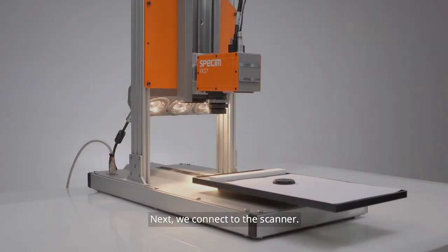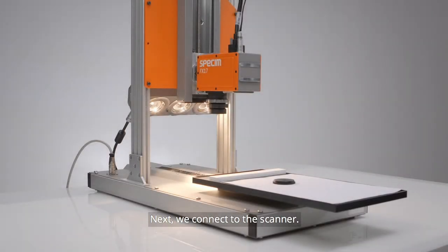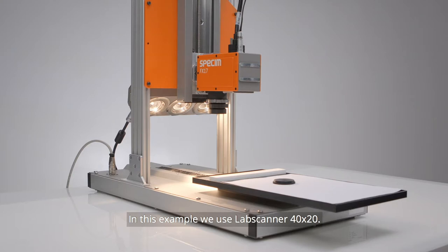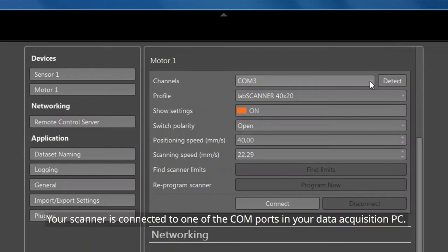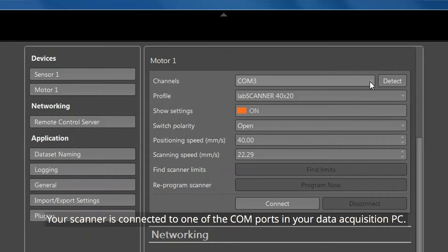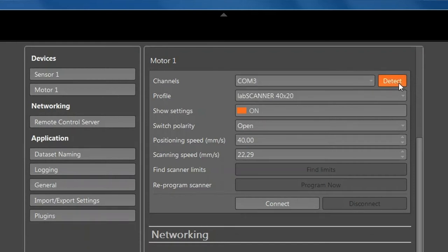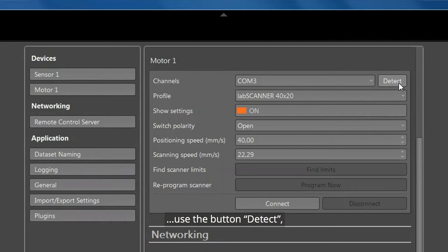Next, we connect to the scanner. In this example, we use Lab Scanner 40x20. Your scanner is connected to one of the COM ports in your data acquisition PC. If your PC has several COM ports, use the Detect button to find the correct COM port for the scanner.